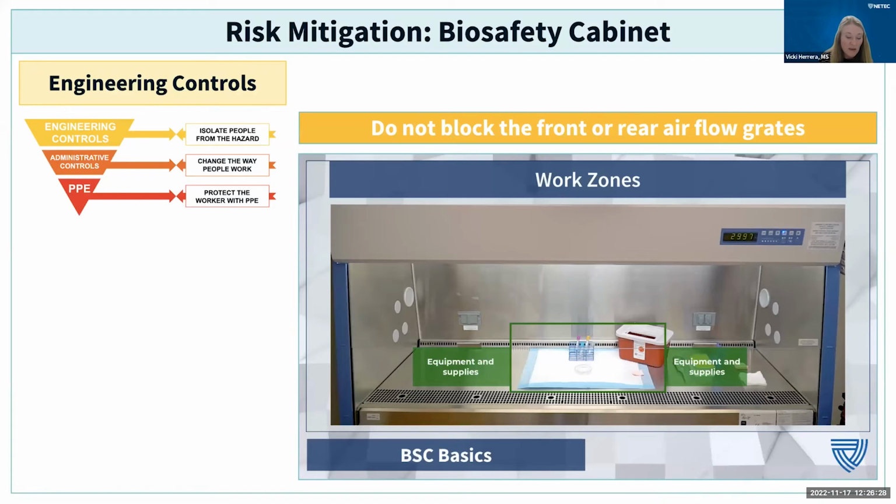The biosafety cabinet is one engineering control that is such a great asset to laboratories. When it is used correctly, biosafety cabinets can help protect personnel, but not all laboratories have one. Not everyone uses them correctly. The CDC, as mentioned earlier, has a great resource on the basics of how to use the biosafety cabinet, and the link is in both the beginning and the end of the presentation.